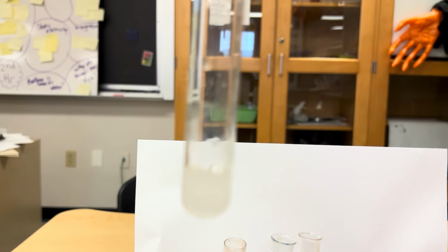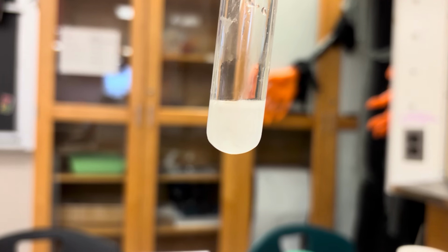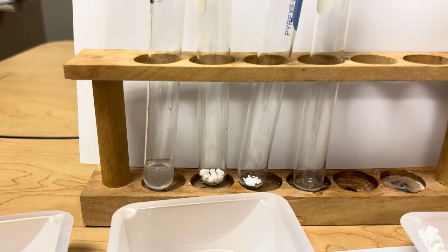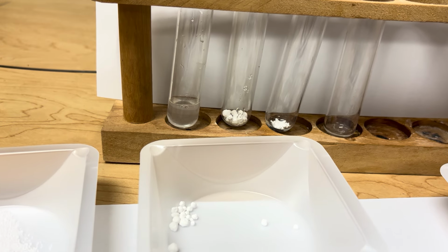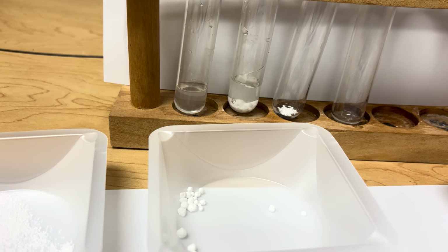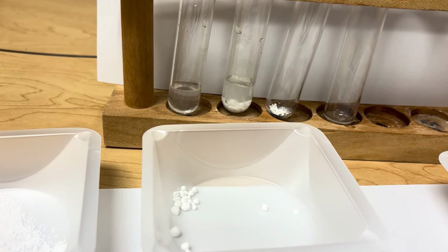And since it is an ionic compound, we know that it is likely to dissolve, but it may not. I'll add water into my calcium chloride now, about the same amount of water, and about the same amount of water into my calcium carbonate as well.